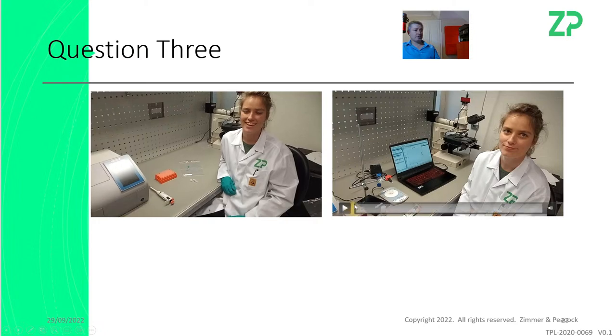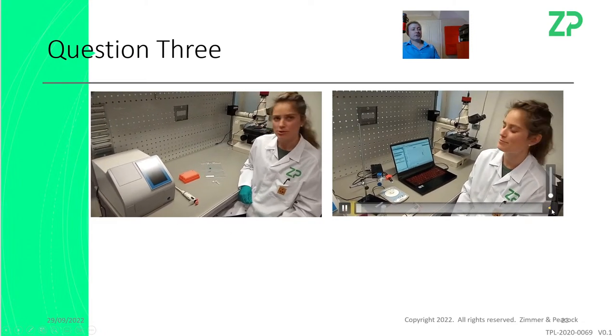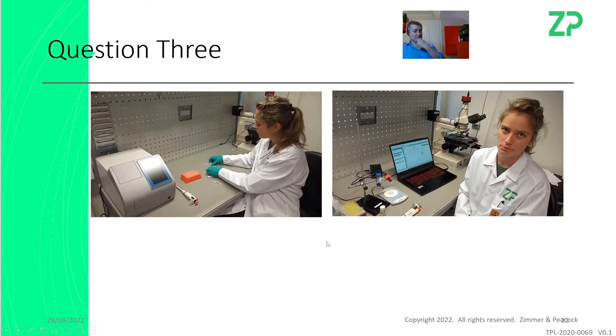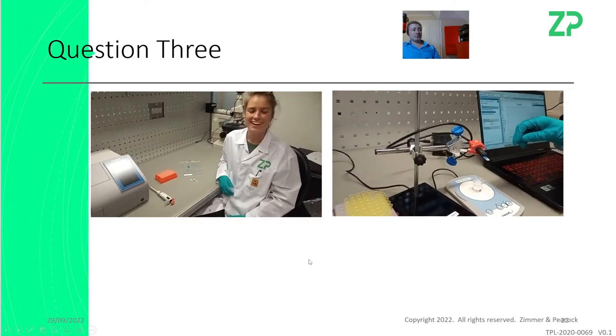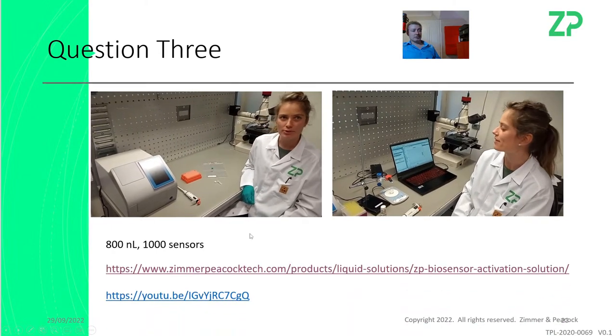There's a couple of videos here. I'll just mute them. But the reason I want to show these videos is to say that we do show you how to modify electrodes on our website, and we also show you once you've modified the electrodes how to actually, let's say, do some testing. So these videos are definitely linked underneath the video.